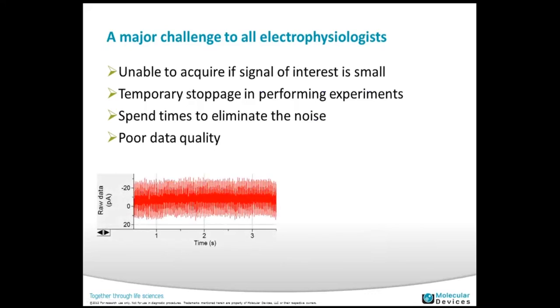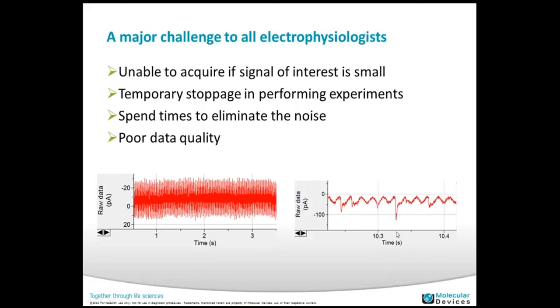Here are a couple of examples. This is raw data — you can see so many peaks, that is the noise, and it's hard to see the signal inside. Another example: most of you may be familiar with these traces — these are minis. You can see the minis sitting on top of this 60 Hz noise. It's very hard to see how many events are on these traces.